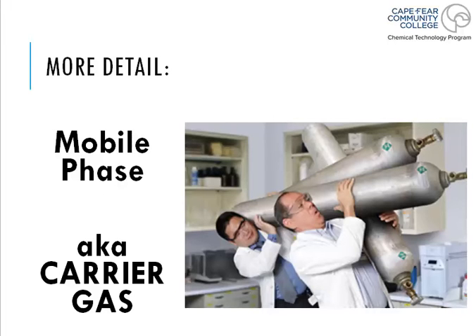Now, if you look at these guys' faces, I would probably assume that they would have that face lifting those heavy tanks the way that they are. Because if you try to pick up one of those tanks, just one of those in the lab, good luck to you. You'll need 2 or 3 guys to pick it up and be sluggish down the hallway while you carry it. But the mobile phase we typically call carrier gas. And that's why you see the picture that you're seeing here on the screen. That's the carrier gas, because they're carrying the gas that is used for the GC system.